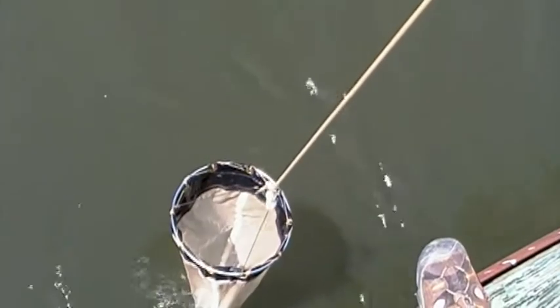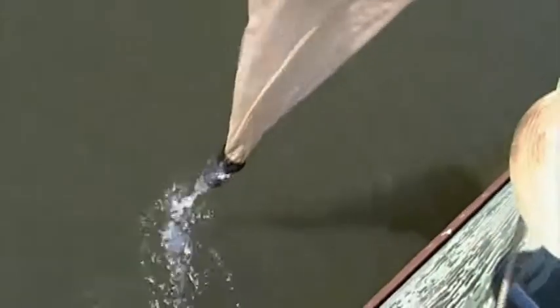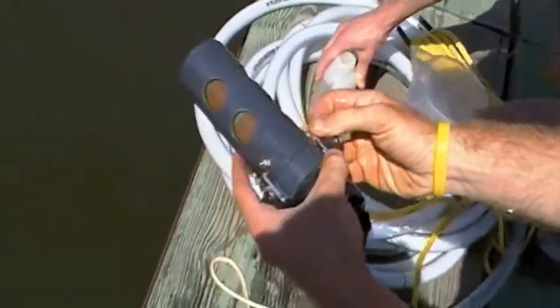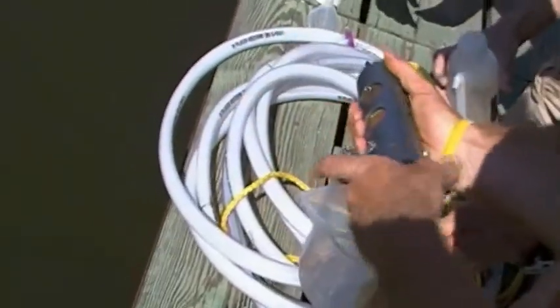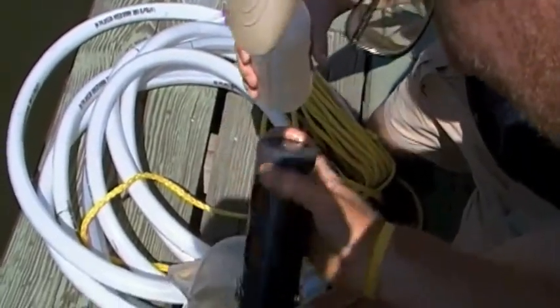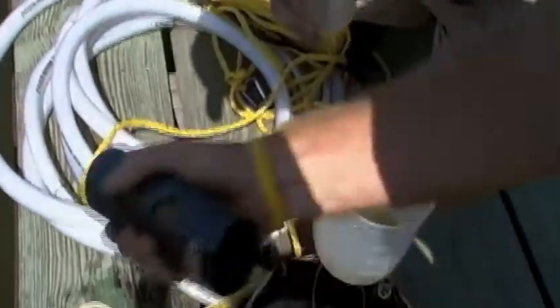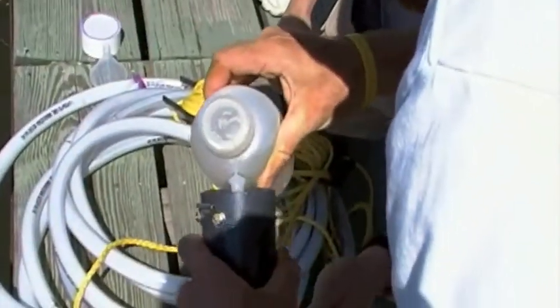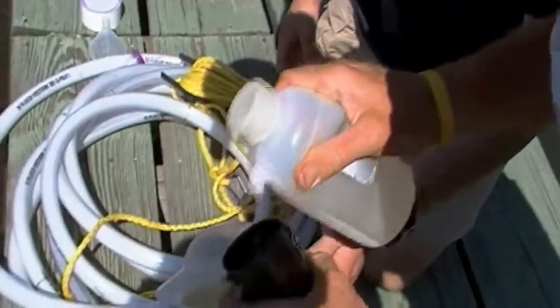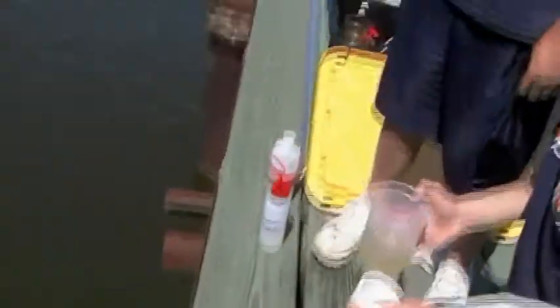Bring it about halfway up, and then bring it back down again, but don't let the ring go below the water. Then you can bring it all the way up. Take the latches off the cap and pour it into a container. Then rinse out the cap with pond water two times. Then pour that water through a 60 micron sieve.